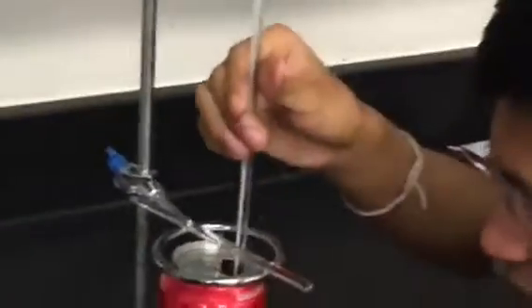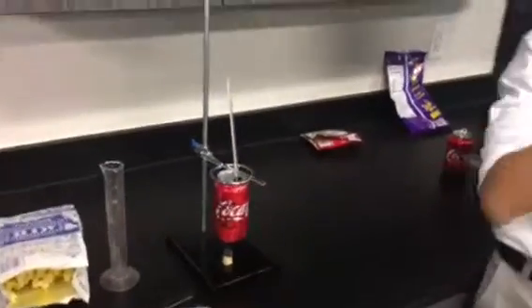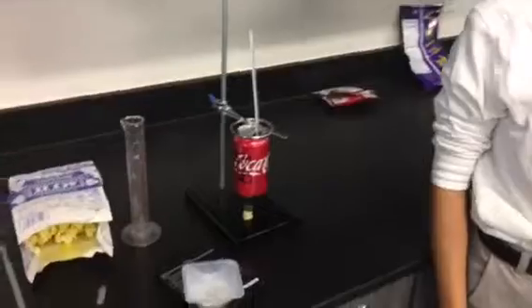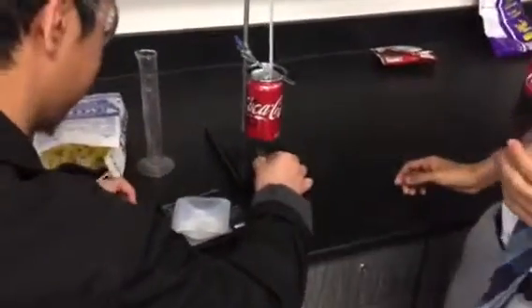What's the temperature? Degrees Celsius? 35 degrees Celsius. Now we need to measure the final mass of the food sample. I took the chip off, and there's nothing. Take it off.